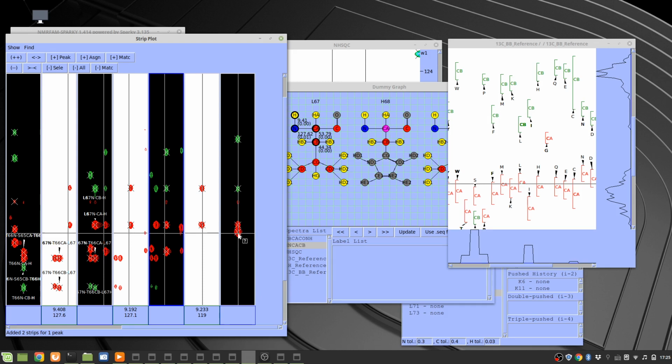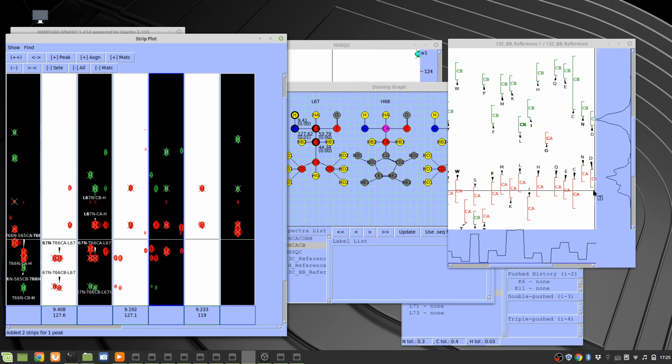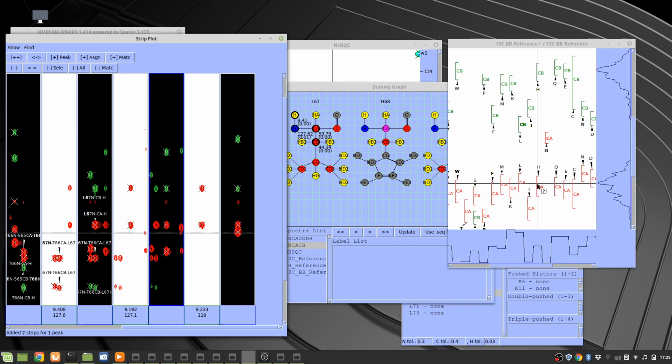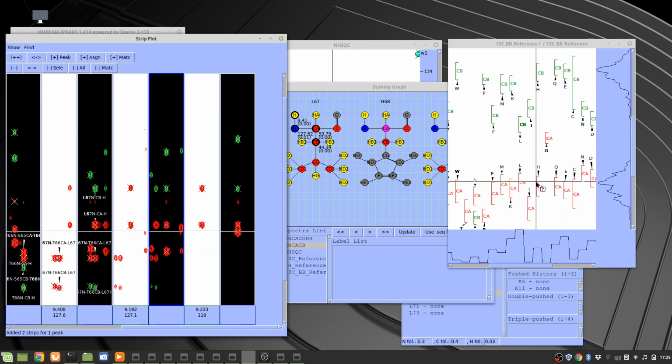Then we need to compare the individual chemical shift positions. If you look at the carbon alpha position, put your cursor on here, and in the chemical shift reference view, it's in the range of histidine. So this range is one standard deviation from the BMRB. So you have to consider it a little bit more generous, but if that is inside, that's very nice.